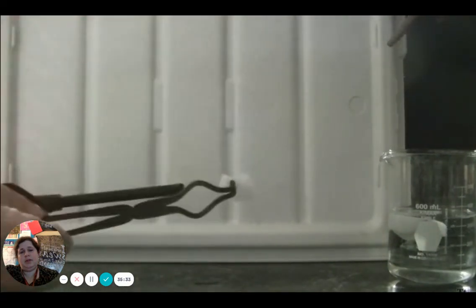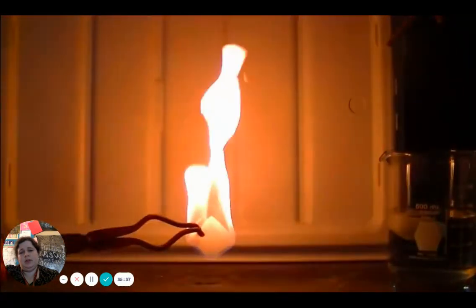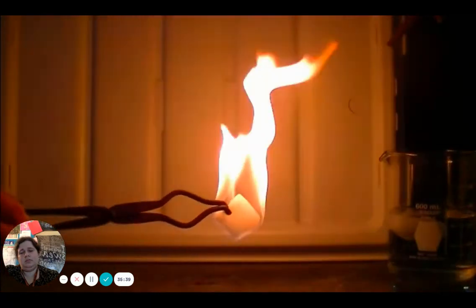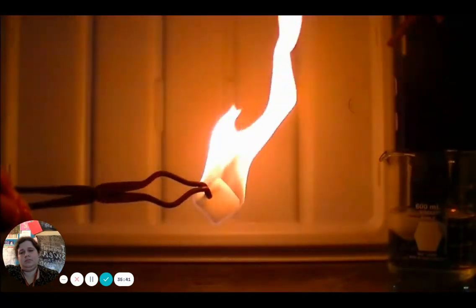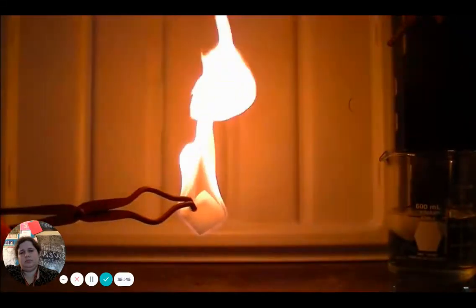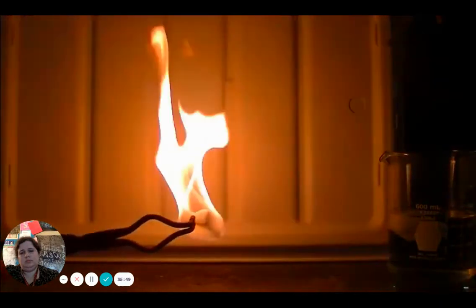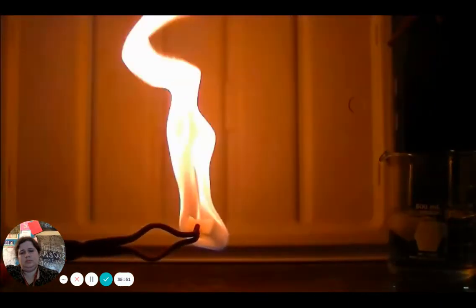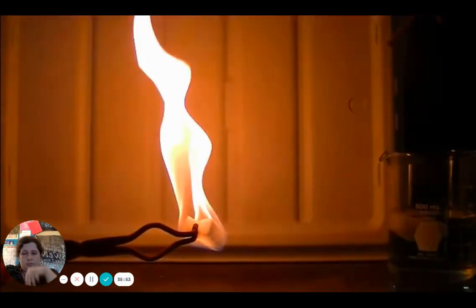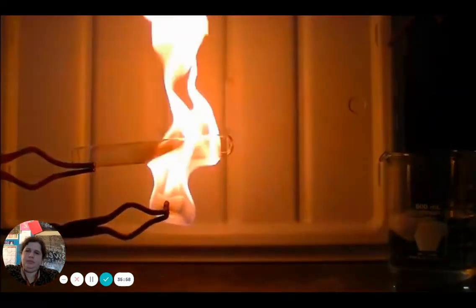So this is rubbing alcohol. There's a lot of yellow in there. What you notice with the isopropanol is a very bright orange-yellow flame. That is indicative of incomplete combustion. Very little blue in the flame. So there's not much complete combustion going on. I'm going to take this test tube here and run it through the flame.